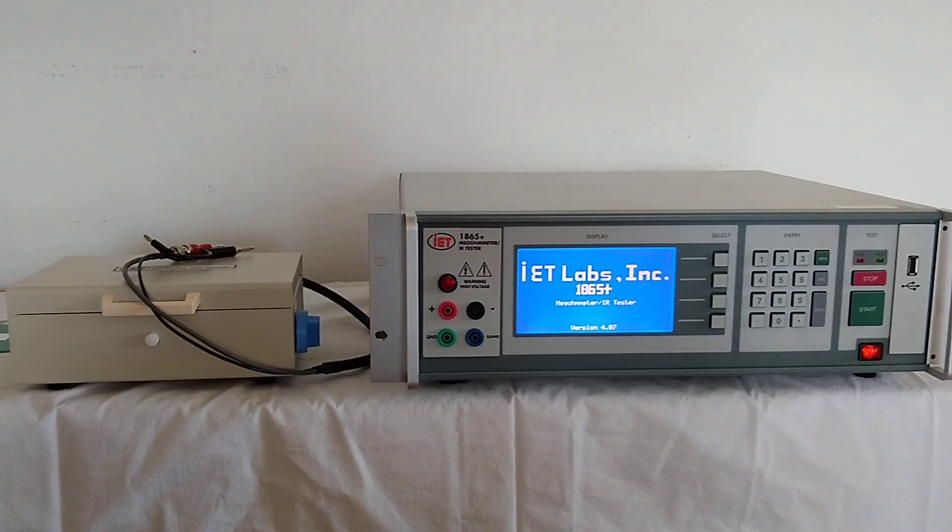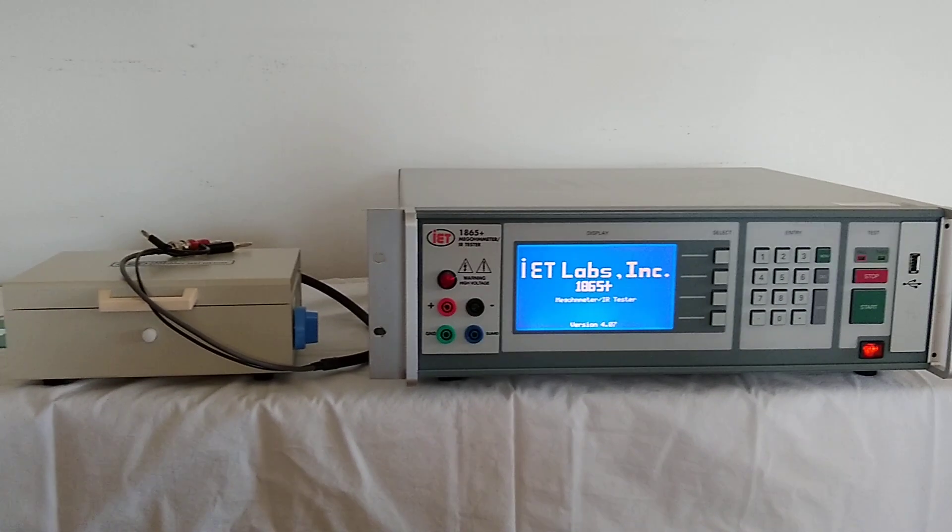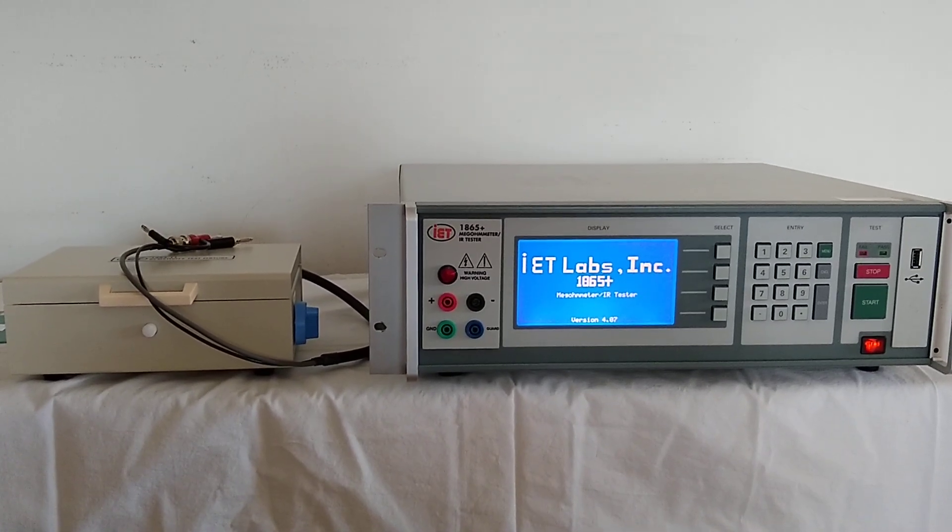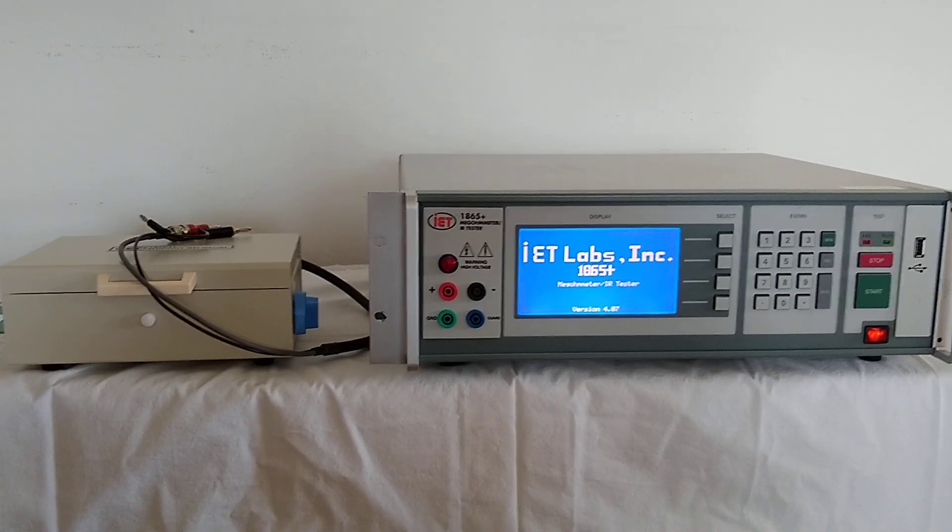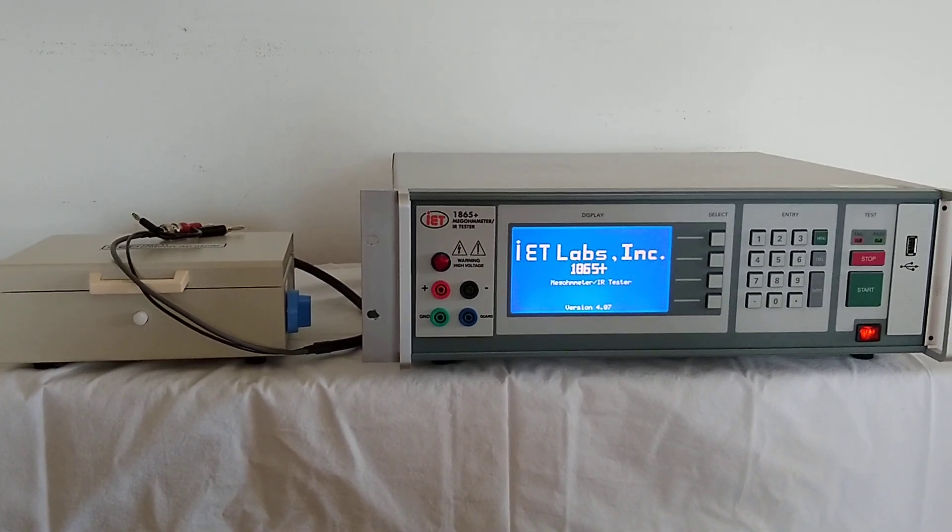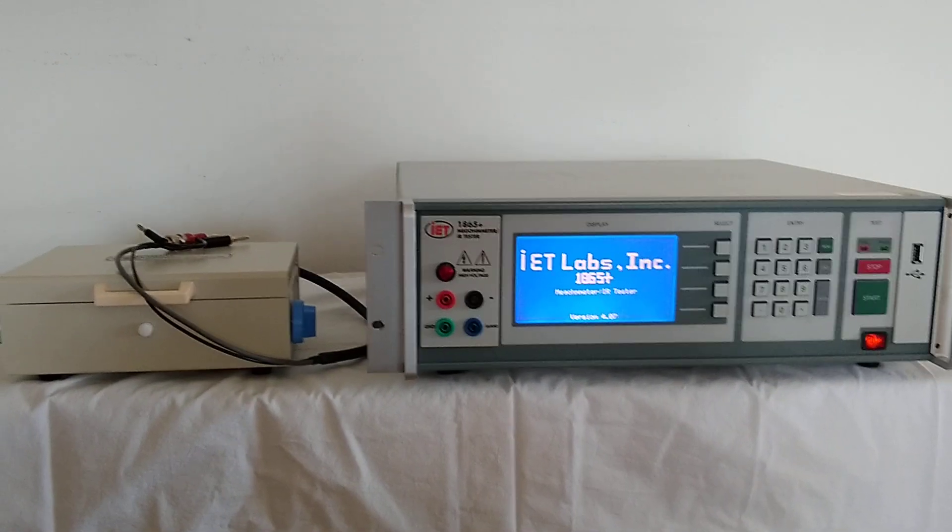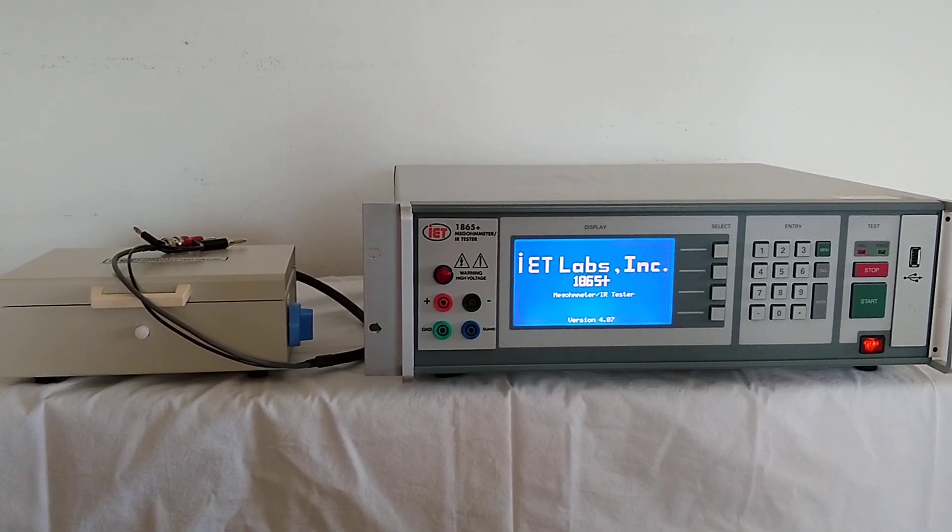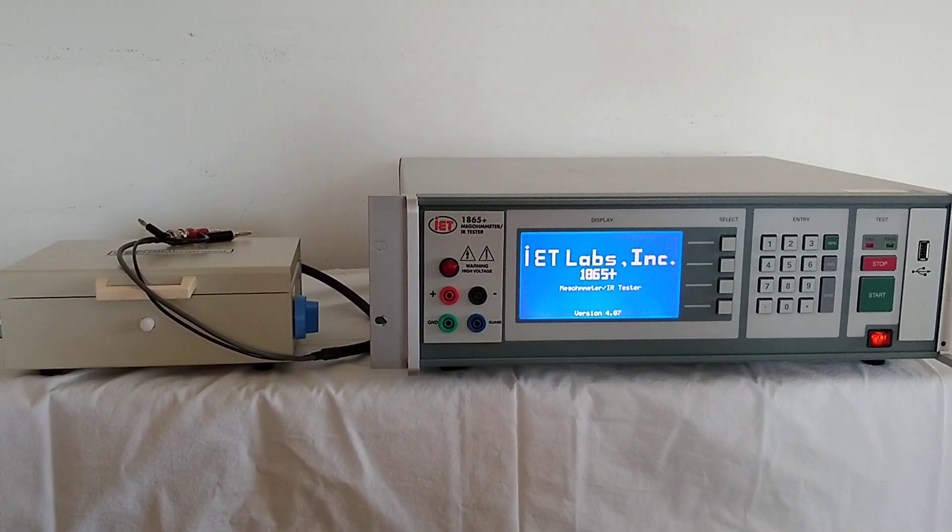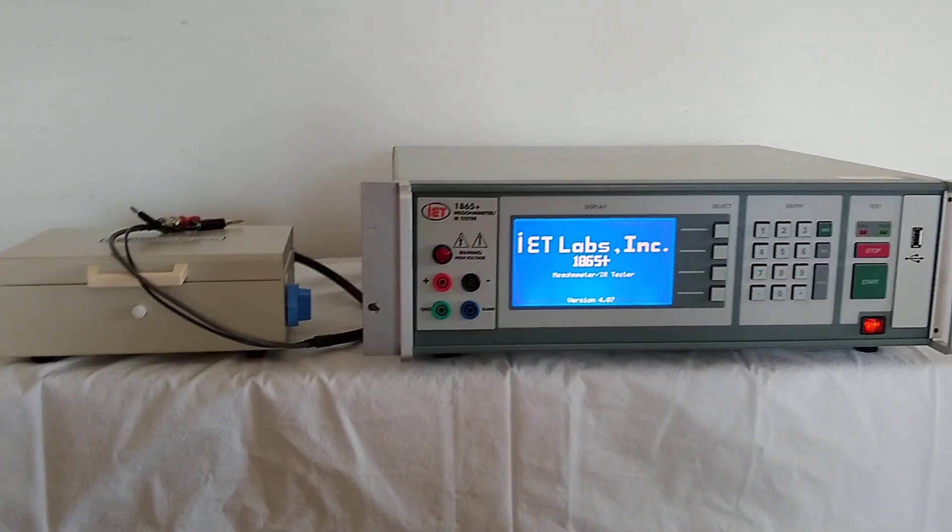Welcome to IET Labs demo of the 1865 Plus in conjunction with the 1865-11 volume surface resistivity cell. This is intended to show you a quick example of how you would measure volume resistivity using the cell.